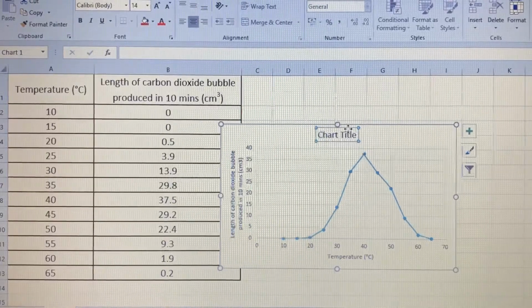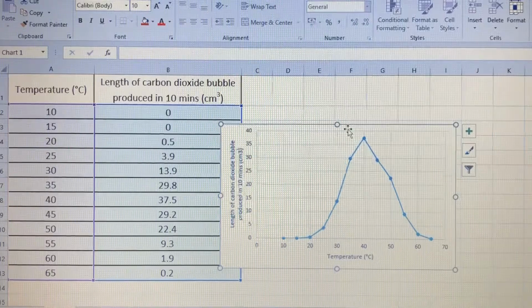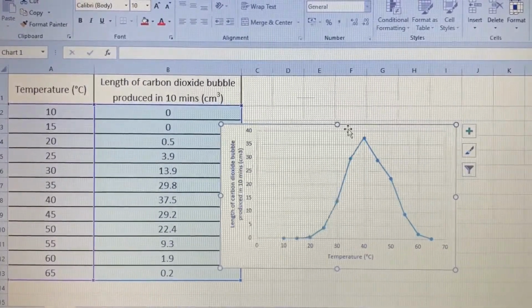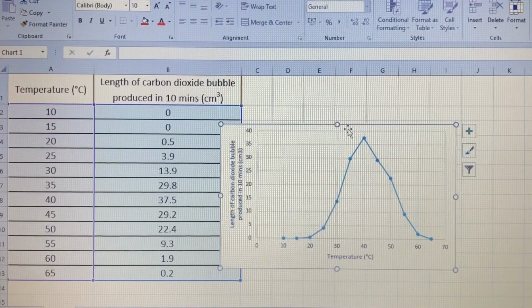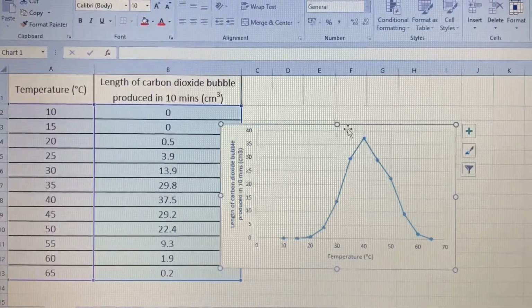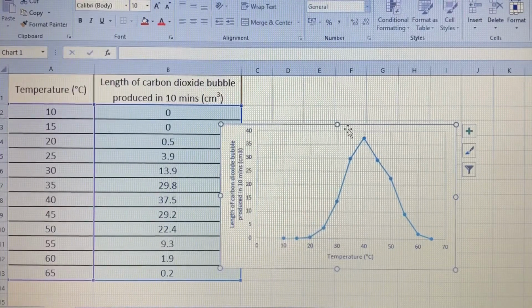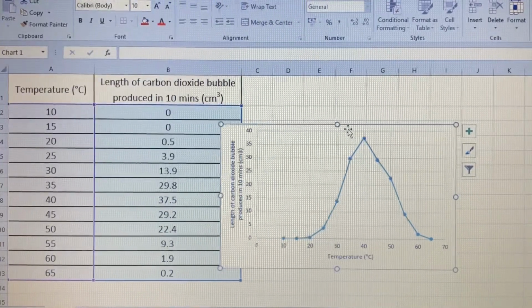Now sometimes when you do this, if I put maybe a higher concentration of glucose, some of those readings would have gone beyond the burette. So it would have filled the burette and more. So it's useful to try and choose variables. I think in the past where we were looking at limiting factors in photosynthesis, we actually always got the optimum. But sometimes these programs are a little bit flawed in that they go beyond the readings. That's why I didn't use a higher concentration of glucose. I was afraid that I'd fill the burette as I got to my optimum temperature.